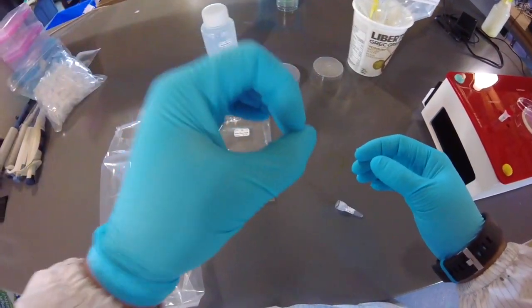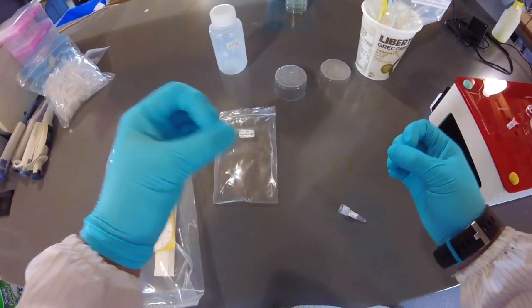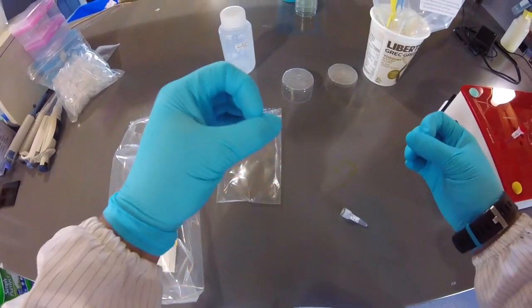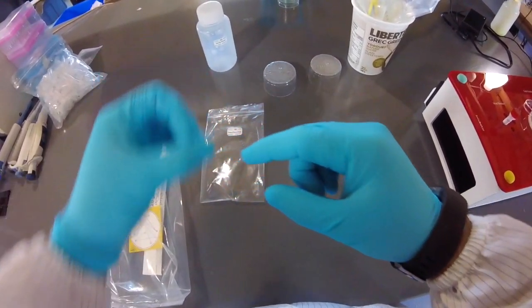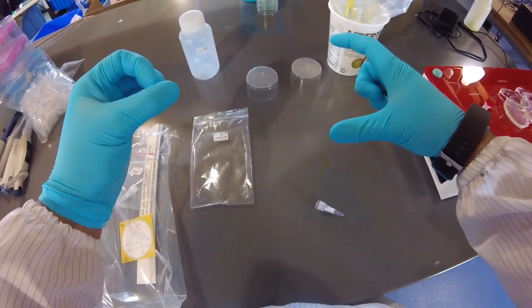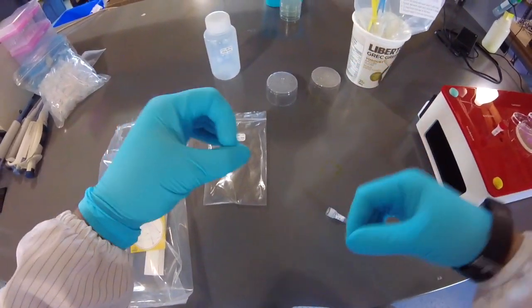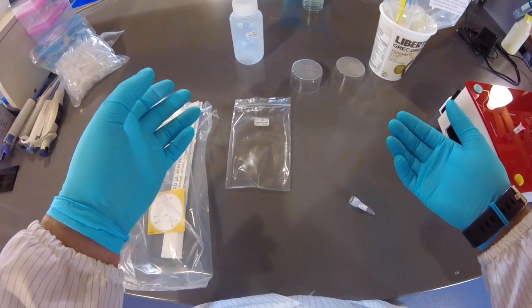So if just your 1 plasmid goes in, and then that 1 cell divides into 2, only one of those 2 cells is going to get your plasmid, right? And then during the next division event, same thing happens. With the 1 cell, only one of the 2 will get it, but then the other cell that didn't get it before is just going to split into 2 cells which don't have it, right? So in the end, you're only going to have 1 cell that has your plasmid, okay?